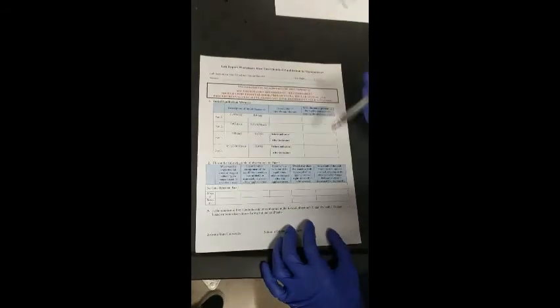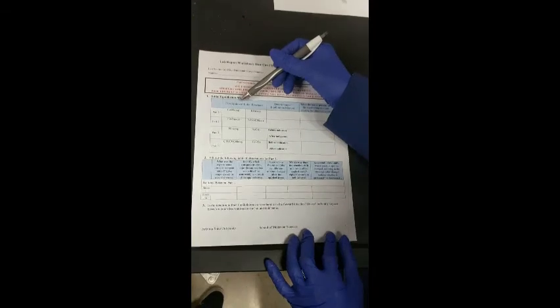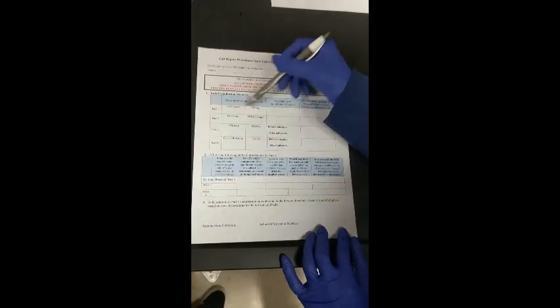Okay, in the worksheet, you're going to first fill in the first table. In the first table, you're going to describe the color of the initial solution for each experiment. And then please describe the color of the solution after mixing them together. And then please give the ion that presents the color in the mixture. Not all ions have color, right? So please only provide which ion has the color in the equilibrium mixture.